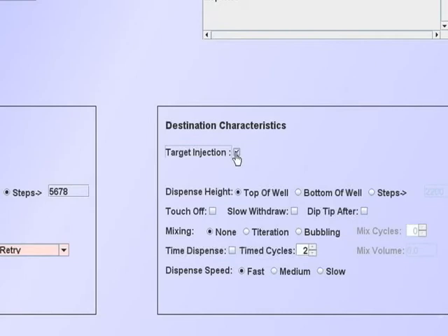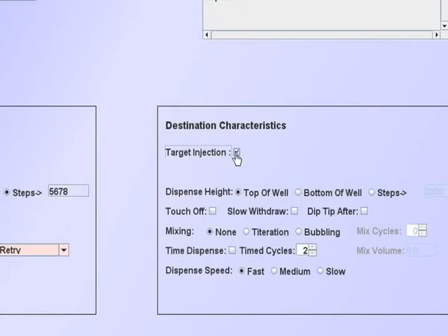This will minimize droplets clinging to the tip exterior, particularly when dispensing small volumes. This is a non-contact dispense, in that the tip does not contact the contents of the well where the dispense is made.